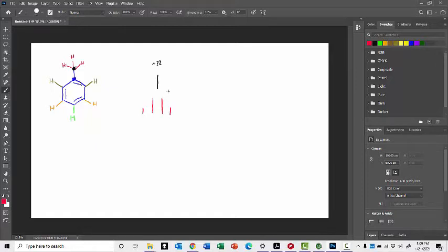So again, a 1,3,3,1 quartet right at 22 is what you'd expect from the influence of the 3 hydrogens that are directly bound. And the J value associated with that kind of hydrogen-carbon coupling, which is to say directly bound, is on the order of 160 hertz, as I've shown you. However, the fact that if you zoom in tighter on these, each one of those lines is its own fine triplet tells me that there must be hydrogen atoms further away that are influencing this black carbon.